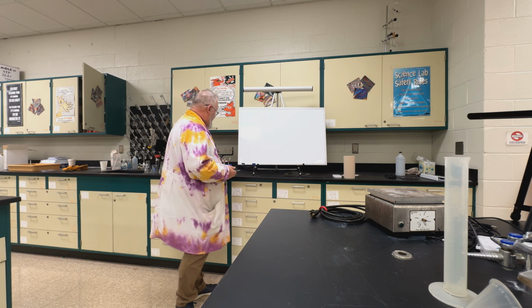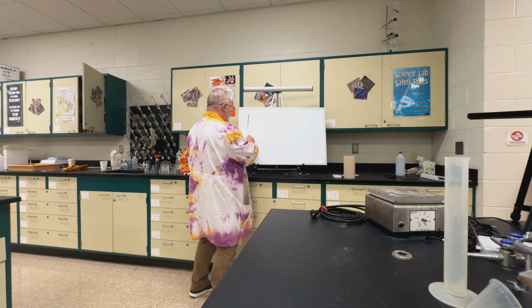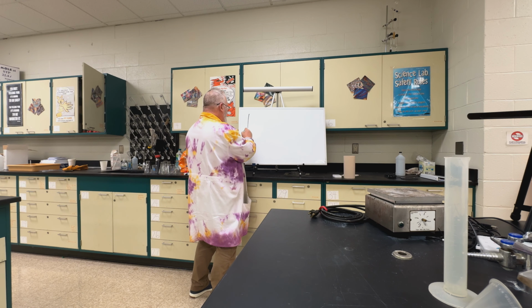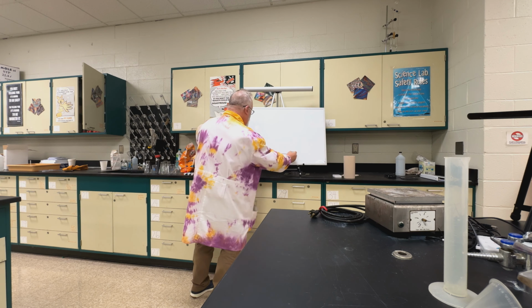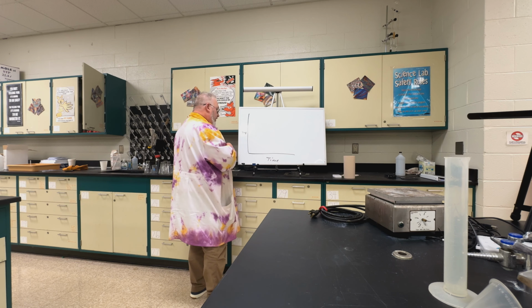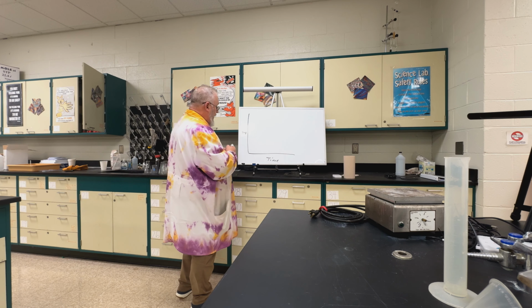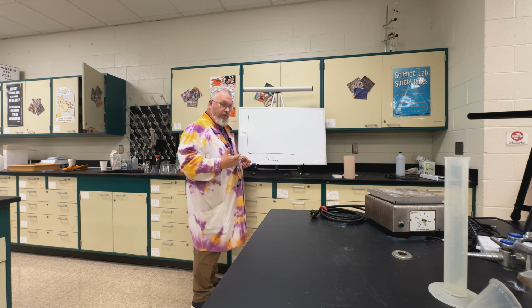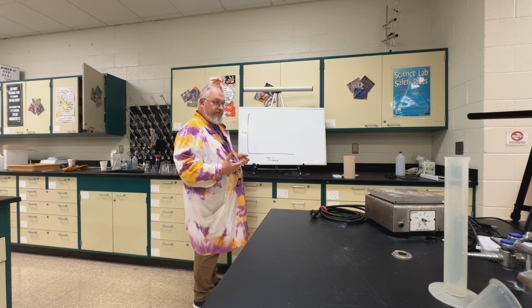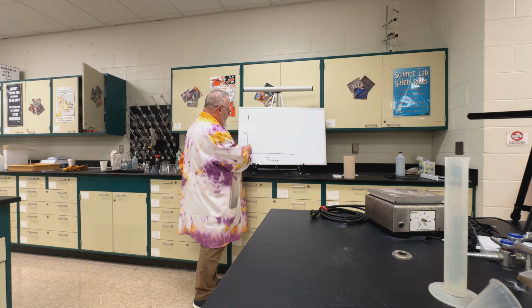So what we're going to see here, if we were to draw a temperature-time chart, is our temperature and here's our time. Okay, we know some things. We assume that the freezing point, or the fusion point, of water is 0 degrees C, so we're going to put that point right there.